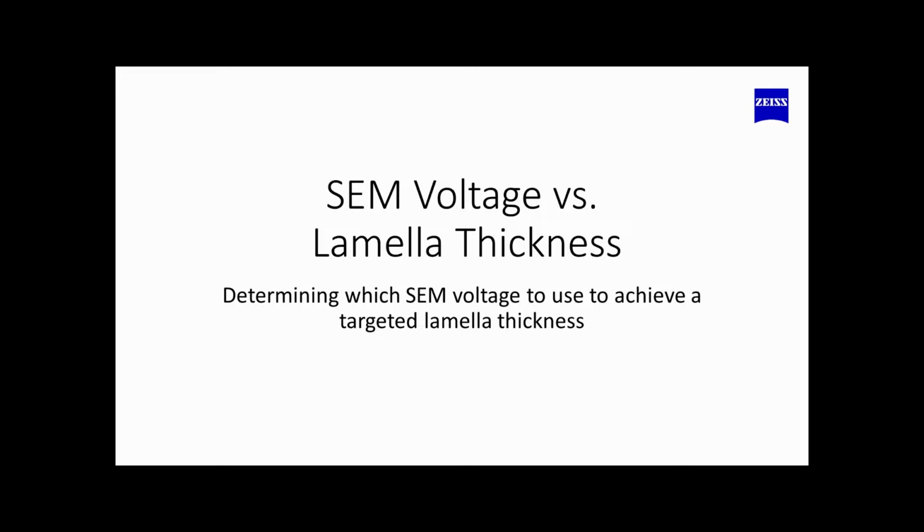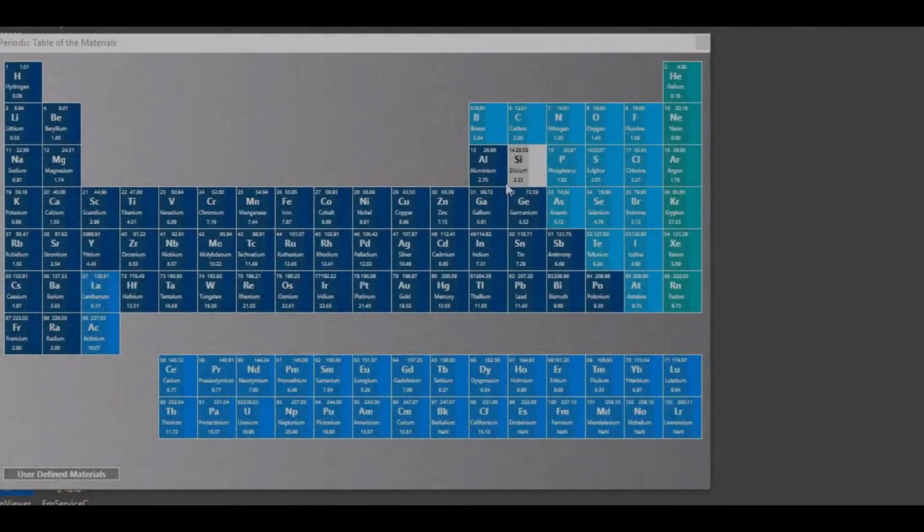Silicon is relatively straightforward and easy. We know from the literature that we need to use 30 kV up to a certain point, that generally the sidewalls of the TEM lamella are going to amorphize at a thickness that's about the same as the probe. So we'll do some of the cuts, and I'll note as we go along, some of them are going to be done at 30 kV, some are at a 10 kV FIB probe, and some are done at a 5 kV FIB probe.